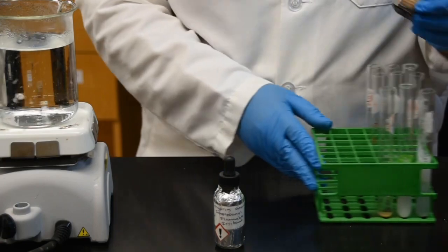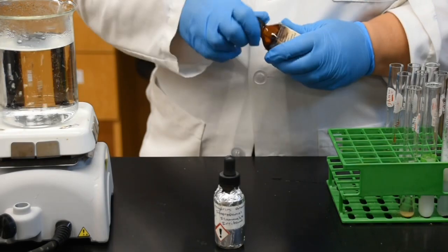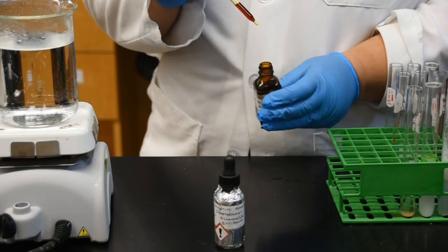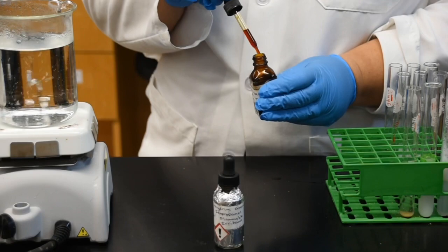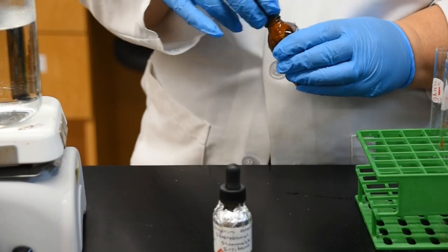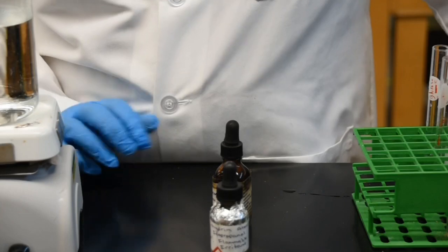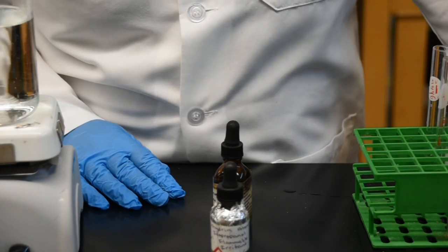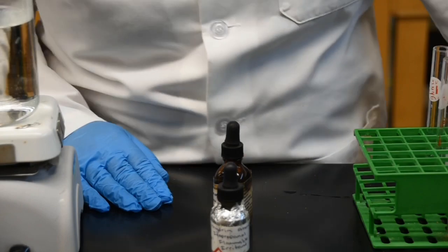The last indicator that we have in this case is our Lugol iodine. Iodine is what you use to clean a wound. The color of this doesn't look yellow because it's super concentrated, but when you add it to the solution and it's diluted, the color is actually yellow. Now, what does Lugol iodine identify? It identifies your starch. If there is starch present in your sample, then the color will change to bluish black. And if there is no starch present in your sample, then the color will stay as the original yellow.